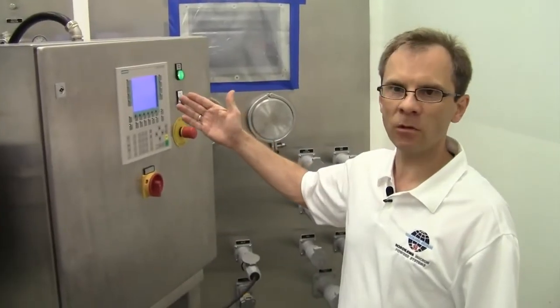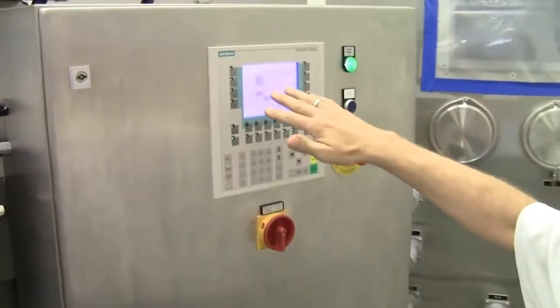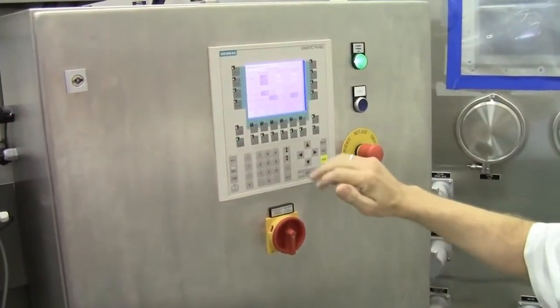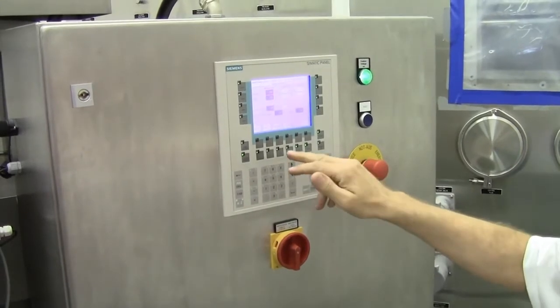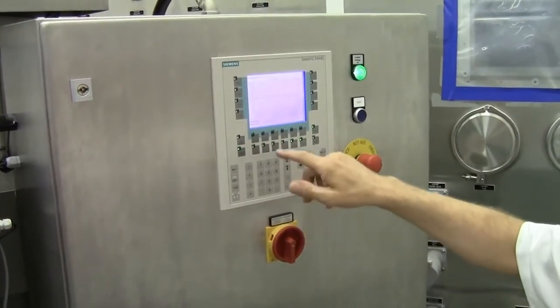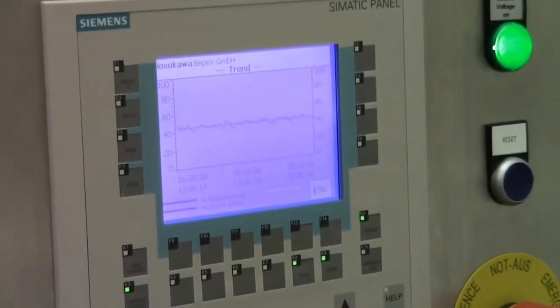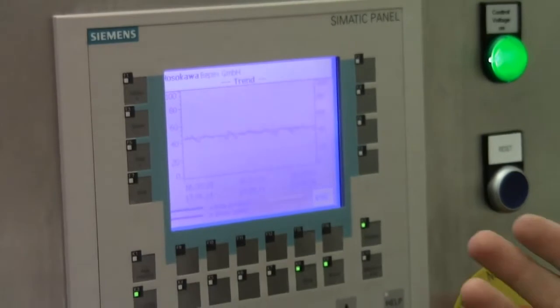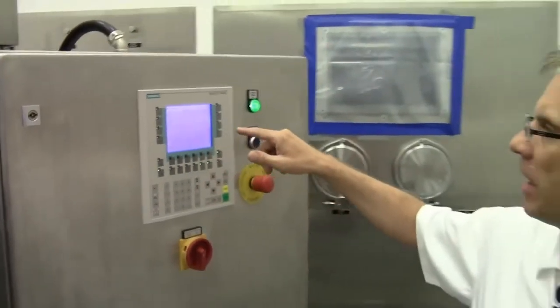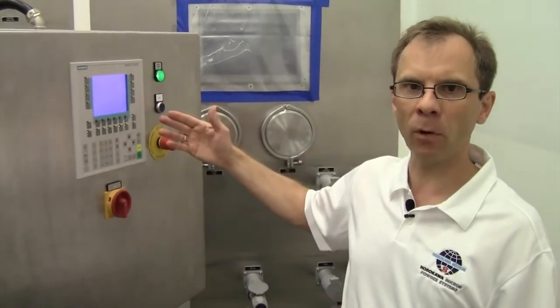Here we can see the actual control panel. It shows the different states and we can also see how the controller works. I look here at the trend, and with that we can see the quality and the homogeneity of the flakes we produce. You can see it fluctuates always a little bit around the set point.